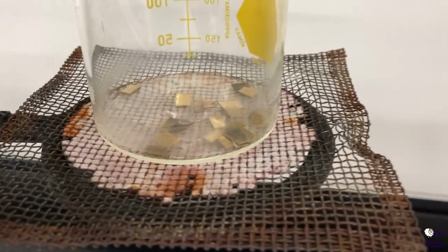We have here at the bottom of the beaker about 2 grams of cut up brass chips. The brass chips are also coated in a polymer film, which we'll see at the end, but that's not really going to affect the results of the reaction, although in order to determine the amount of copper, you will want to do a weigh. You're going to want to dry off that film afterwards and then weigh the mass of those. That way you get the actual mass of brass involved and you don't have the polymer film included. We'll do an actual analysis of these chips at another time. This video, we're just kind of looking at the reaction.